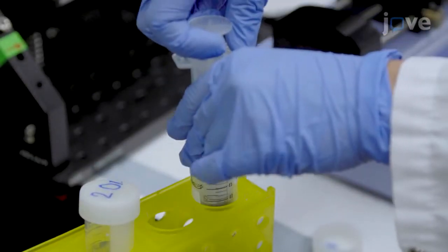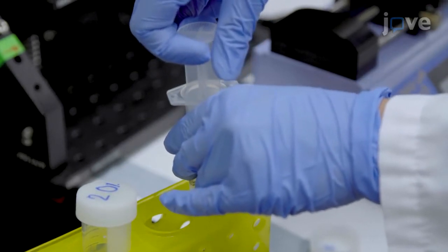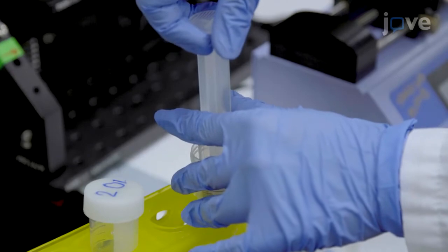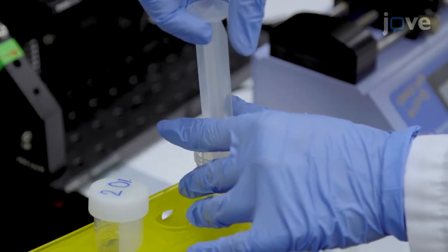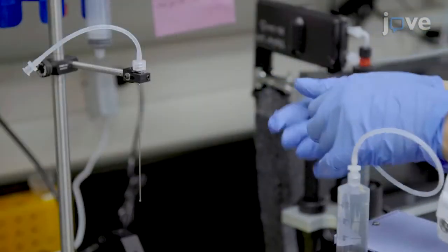Begin by diluting 2.2 molar sucrose to prepare six 10-50% sucrose gradients. Fill a 30ml syringe with approximately 16ml of 10% sucrose, place it on the syringe pump, and connect it to the needle.